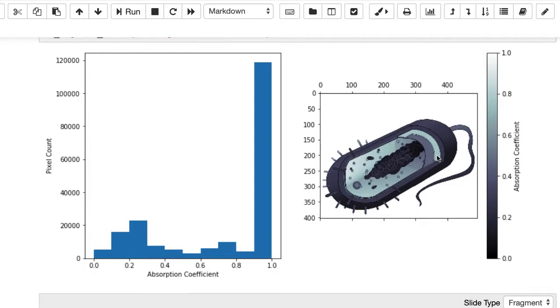And so all of the steps we perform are a balance between looking at the images, making some assessments for yourself, and then applying a quantitative analysis to make sure that you have a robust way of quantifying the things that you already see.